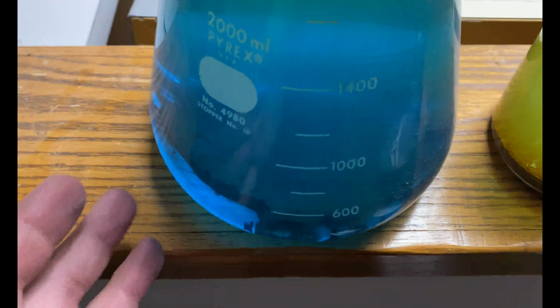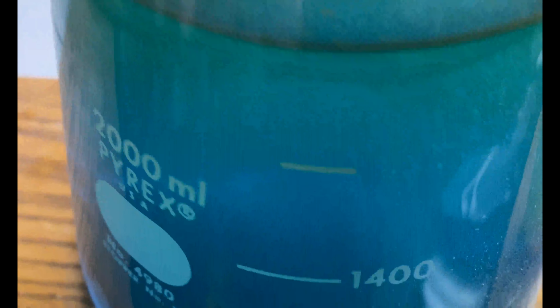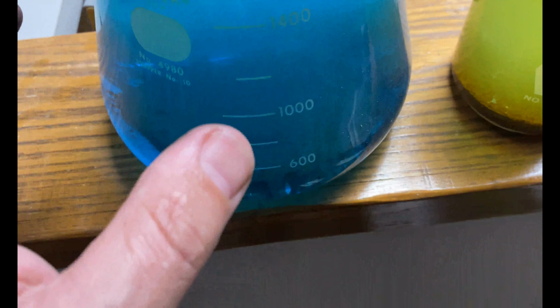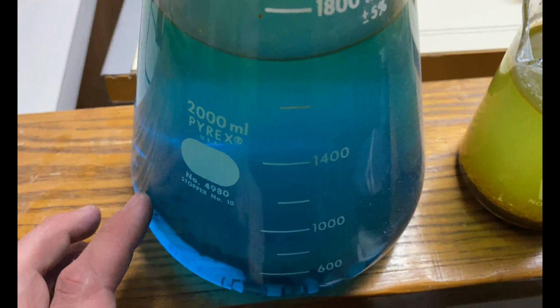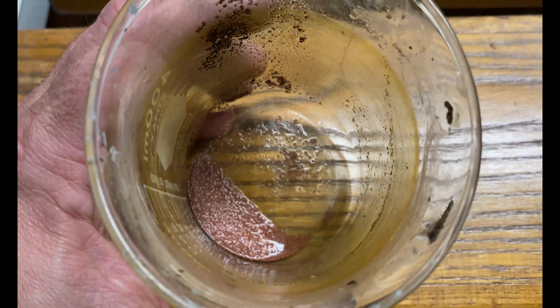And in the blue vitriol, I kind of noticed that it's more blue towards the bottom than it is towards the top. It almost has a little more of a greenish tint at the top. I think probably it's trying to layer out, because perhaps the iron sulfate is a little bit lighter than the copper sulfate, so it almost has a little bit of a layering effect.